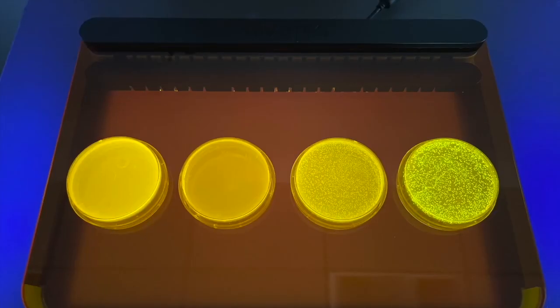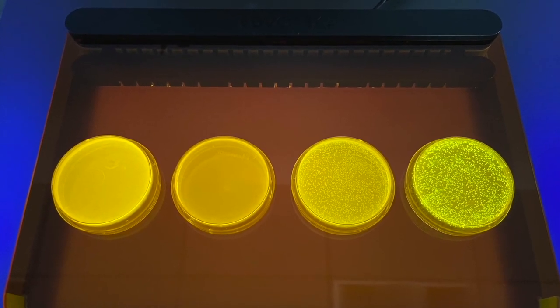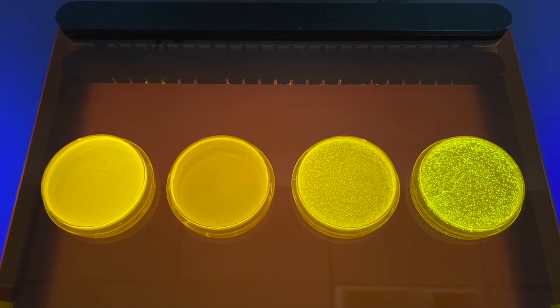Step 5: Visualization. After overnight incubation, use a blue light or UV light to visualize your transformation results.